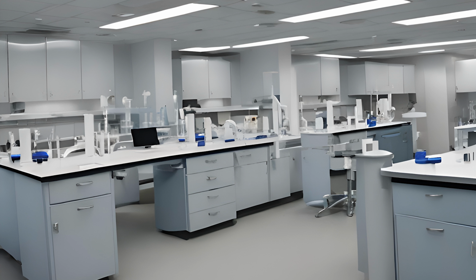An effective tuberculosis control plan will include a determination of exposure at regular intervals for all employees who could be at occupational risk, and the implementation of engineering and work practice controls in the name of preventing an exposure.